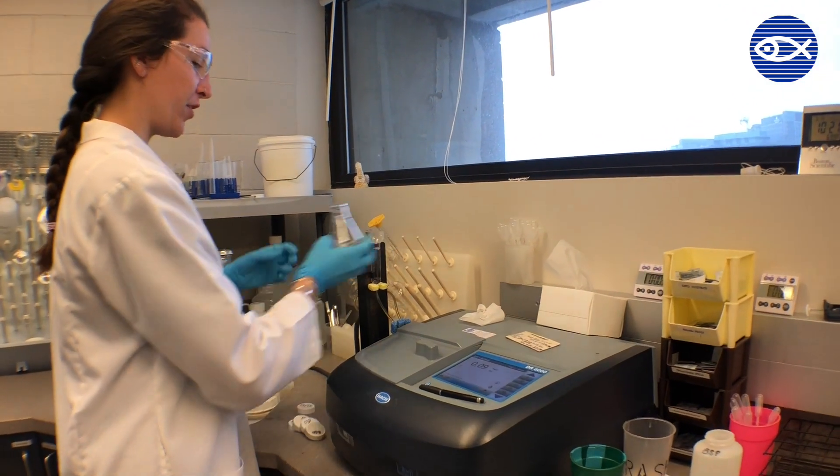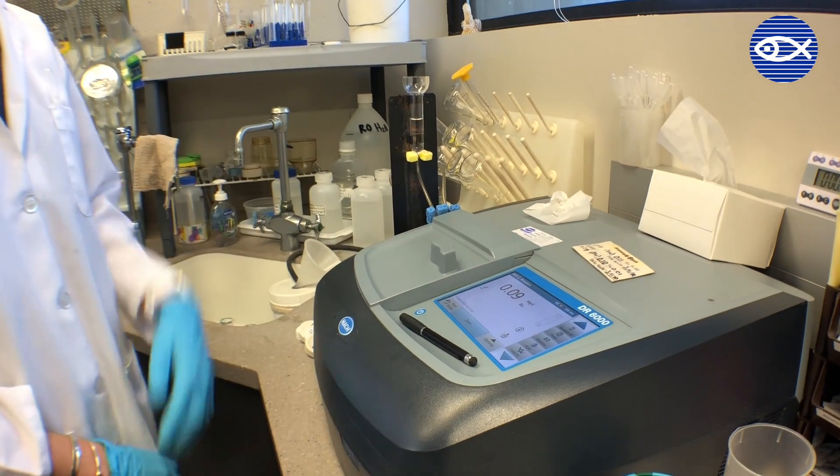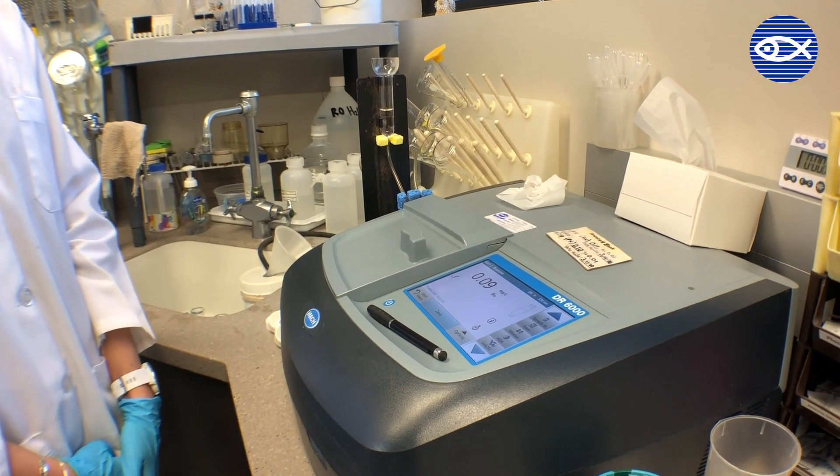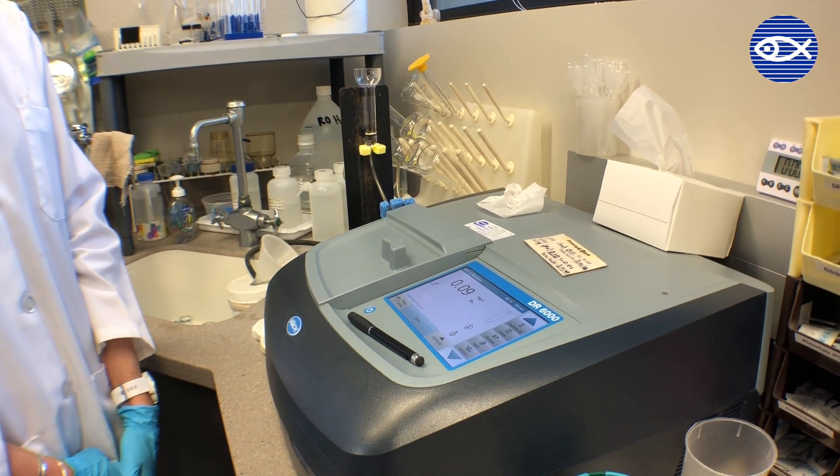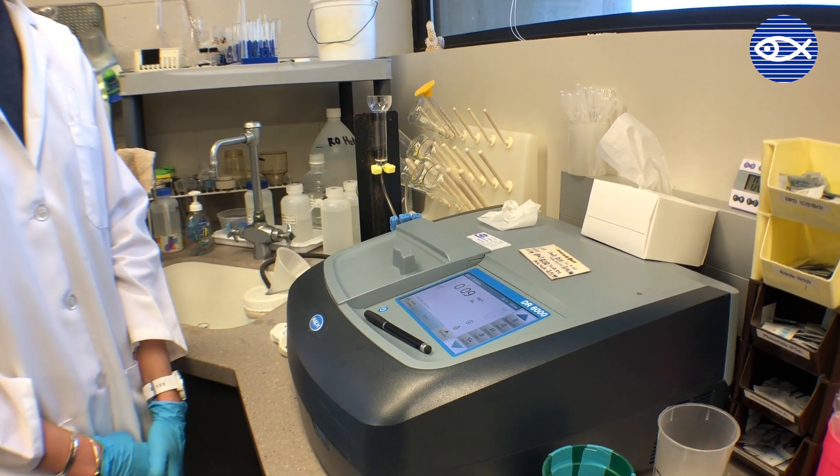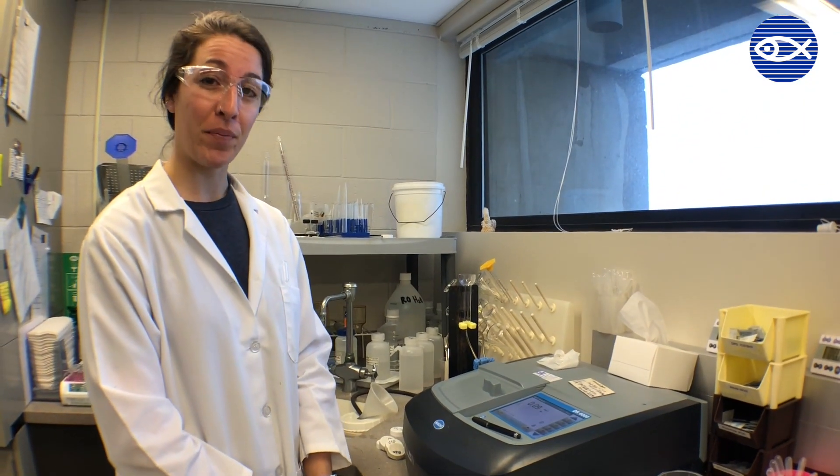So now that's running through and the beam of light is reading the change in color. 0.09. So for this system we can have it go all the way up to 0.2, so this is a very healthy fine level for the bromine to be at.